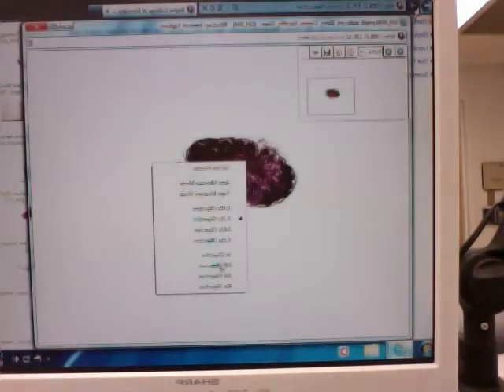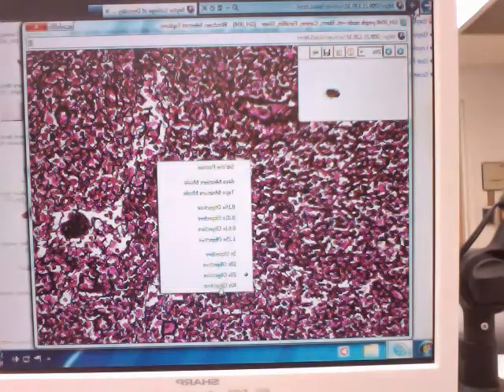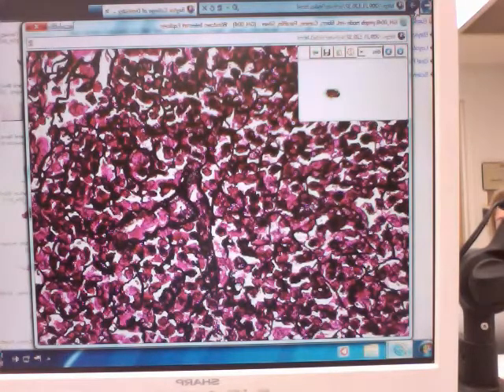Reticular fibers, same thing. When you see this brownish, reddish, pinkish stained slide, and you see all these black fibers running through it, those are your reticular fibers. This is the only brownish, reddish stained slide that has these black fibers running through it. Don't confuse it with elastic in the blood vessel. That looks different, but we'll do that in a minute. This slide is easy. Mast cells is easy. You're hoping both those slides are on the lab quiz.